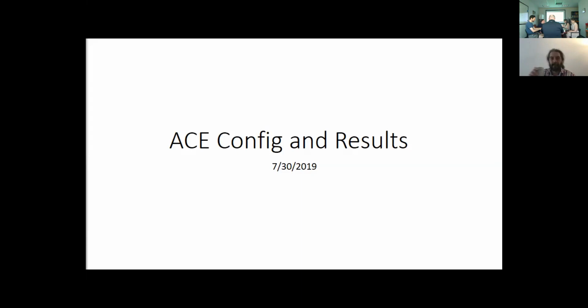So Alfonso, I put together essentially the whole pipeline that I have for ACE so that we could look at it and make sure that the config files are doing what we think they're doing, and some of the stuff you were talking about by email. Sounds great. It would be really great to go through that. Perfect. Awesome.